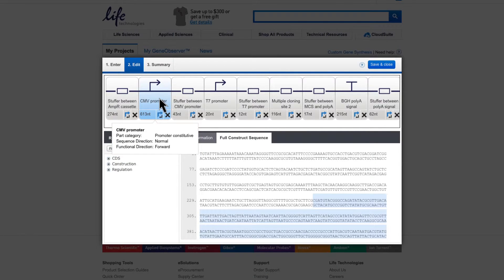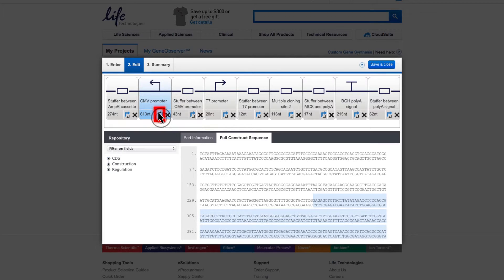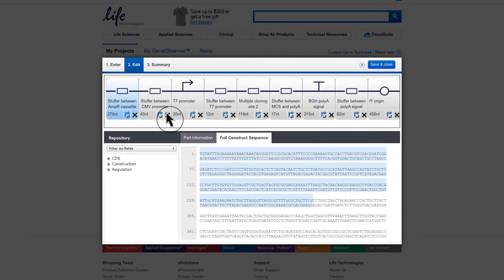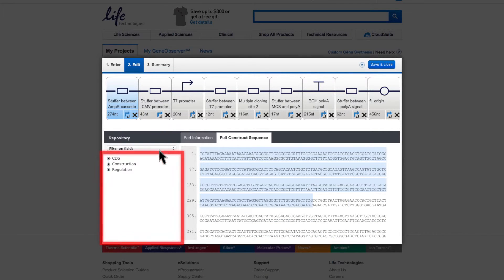Within the Construction pane, you also have the option to switch the direction of an element by clicking on the Reverse Complement button. Elements can also be deleted from the construct by clicking on the Delete button. If you want to add additional elements, you may make use of our Parts repository.